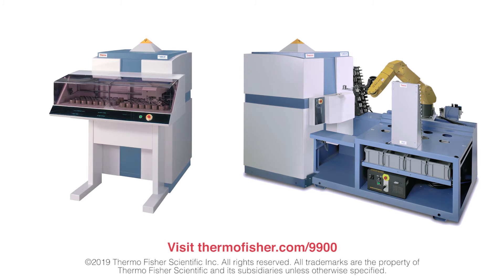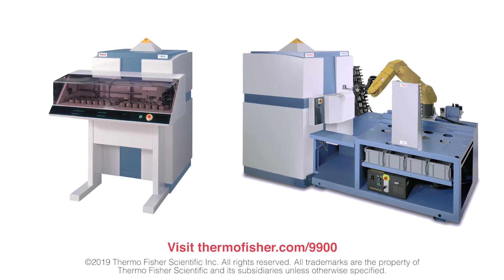Find out more about the ARL 9900 IntelliPower series at thermofisher.com/9900.